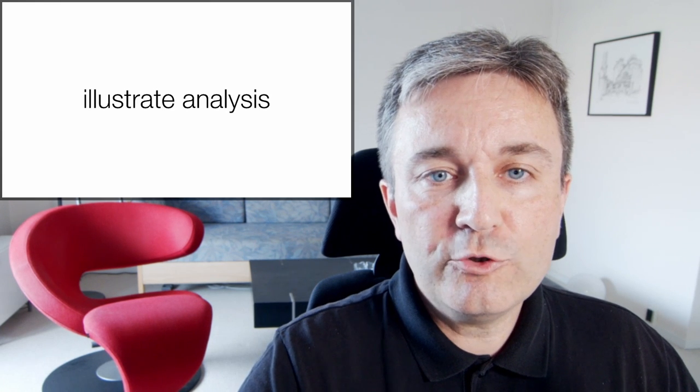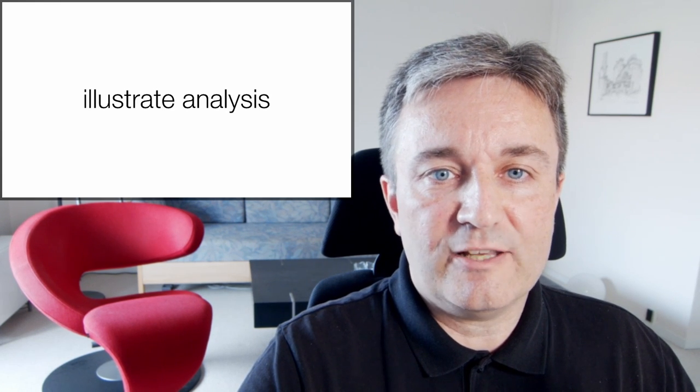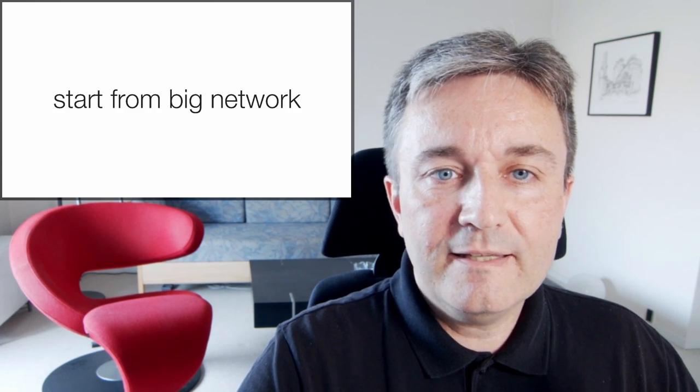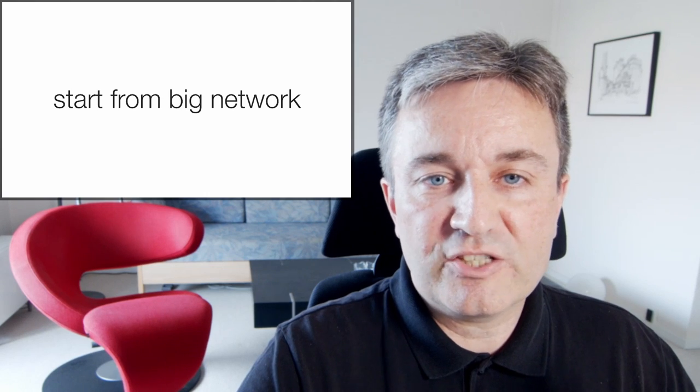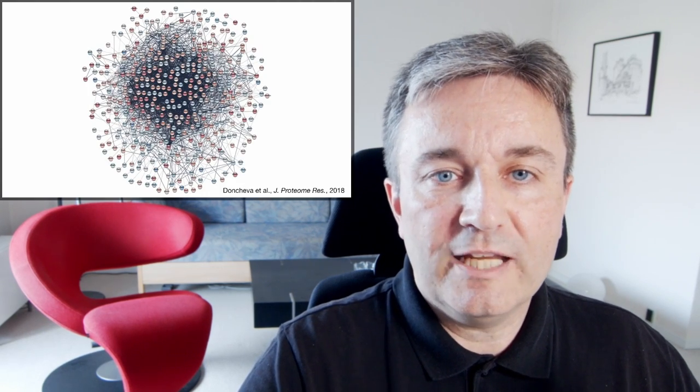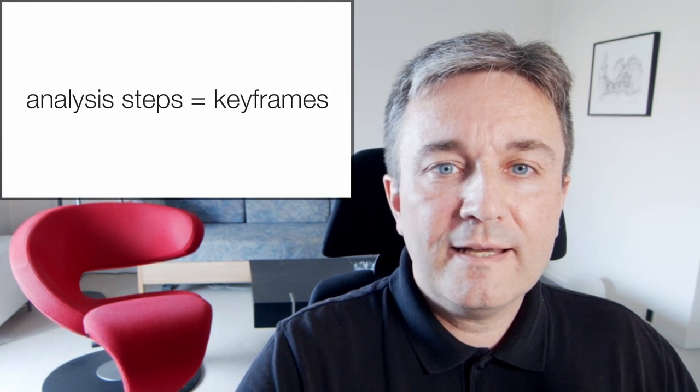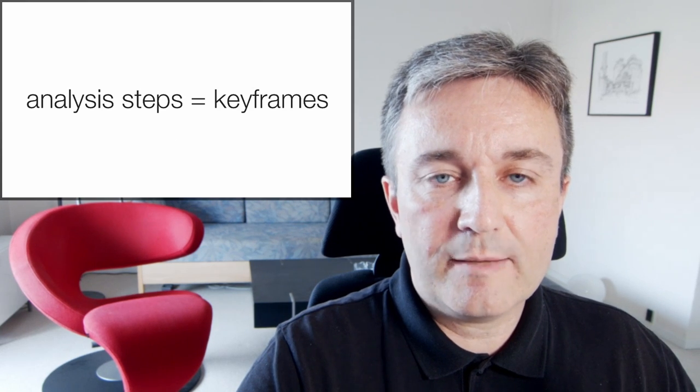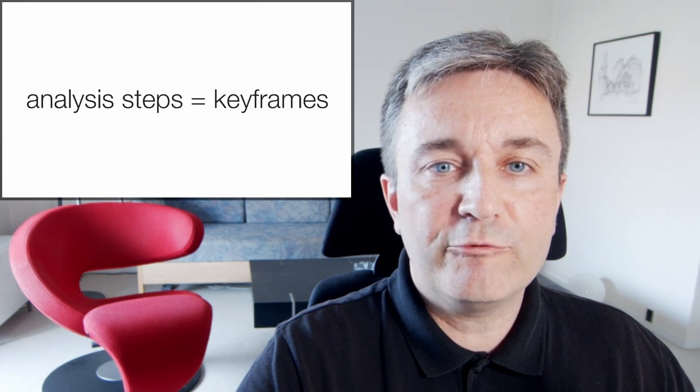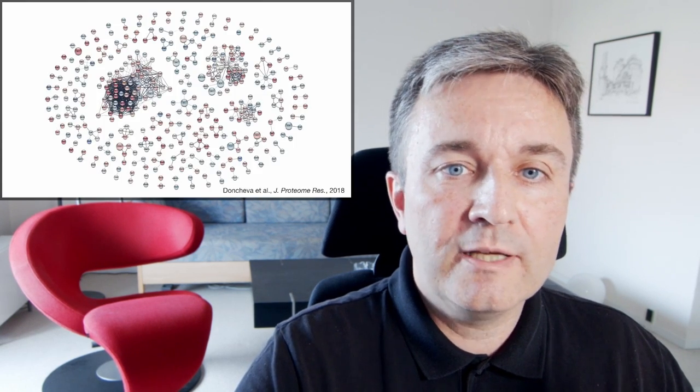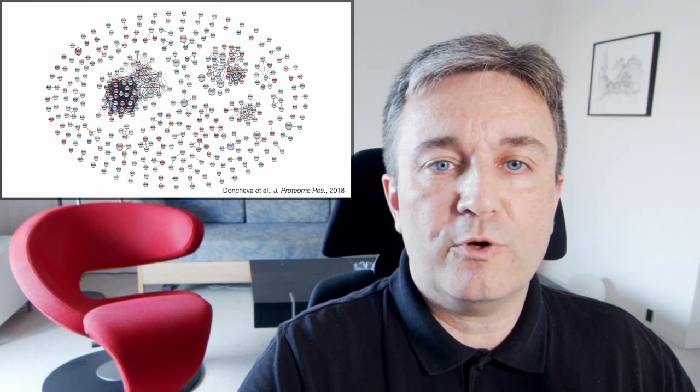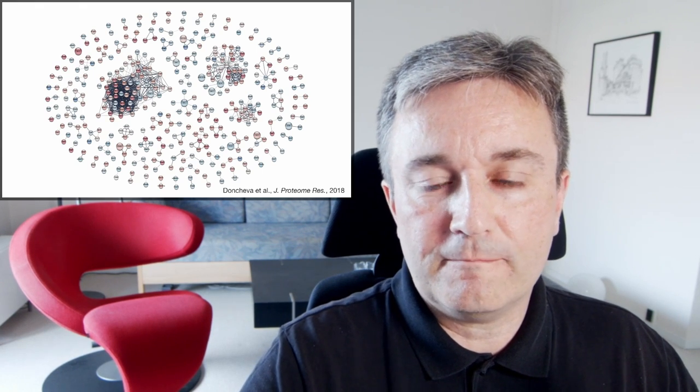You can also use animation to illustrate an analysis. In this case, you might start from a big network looking something like this big hairball, and then have different analysis steps be different keyframes showing how you get from that to your final, much nicer network visualization.